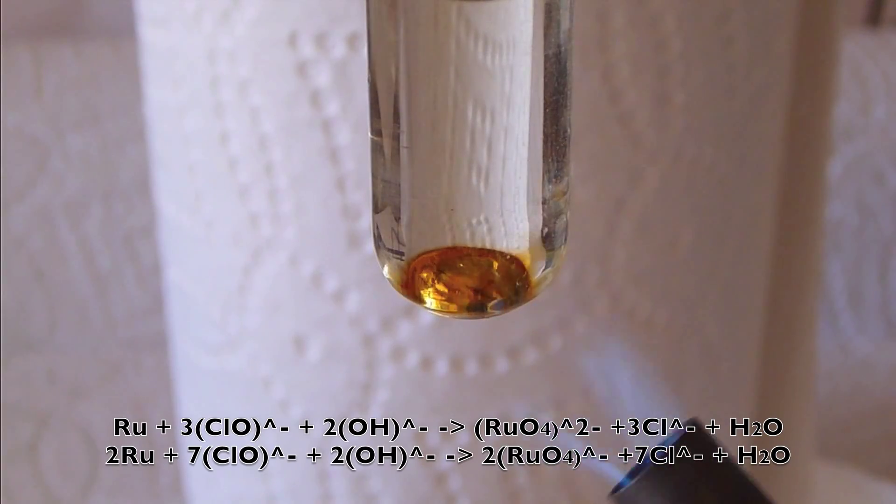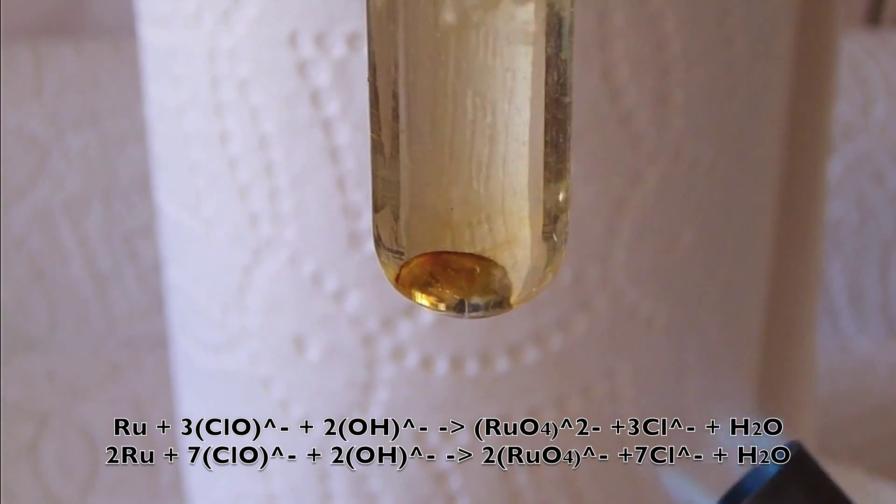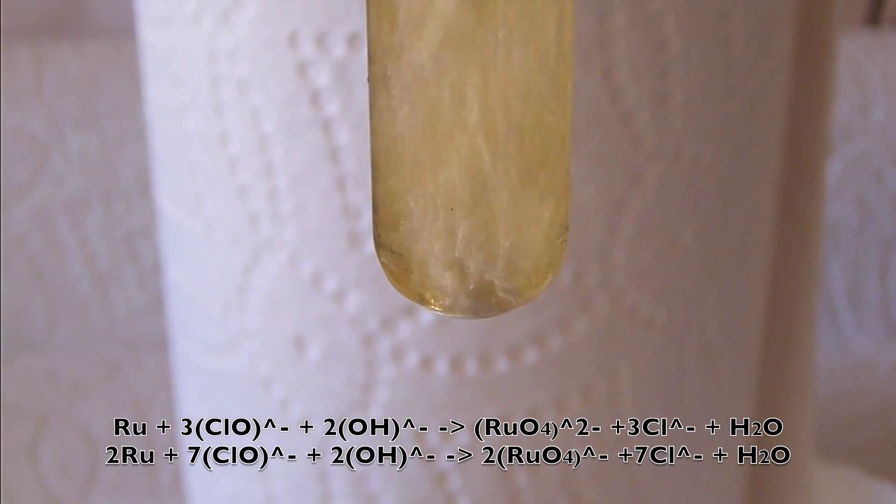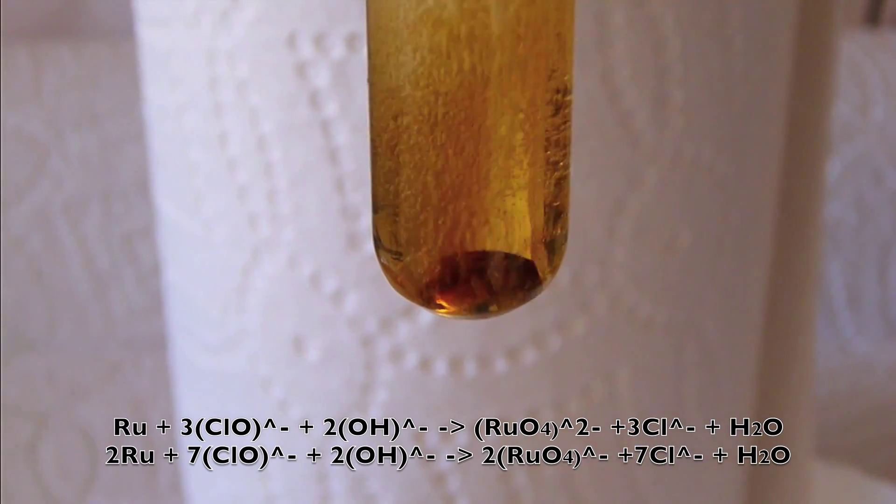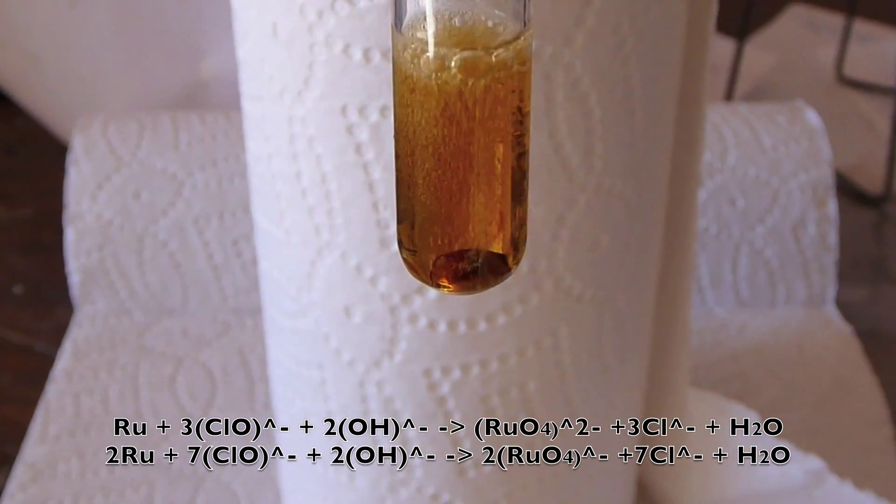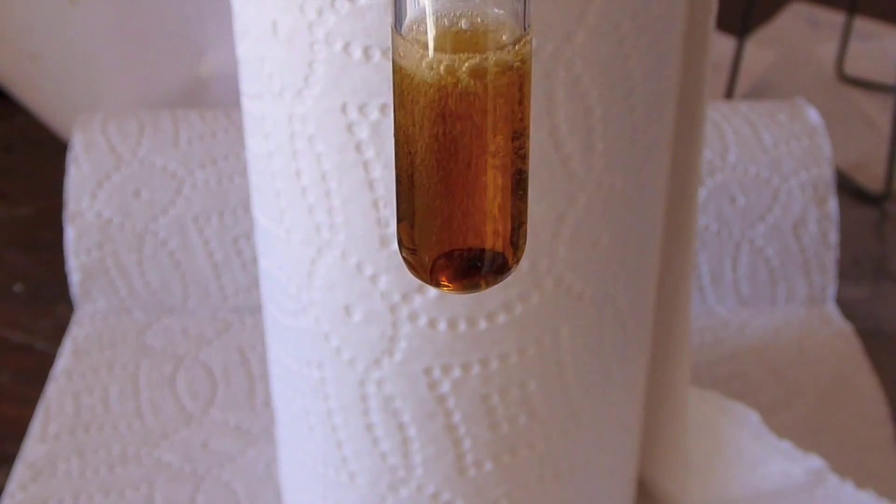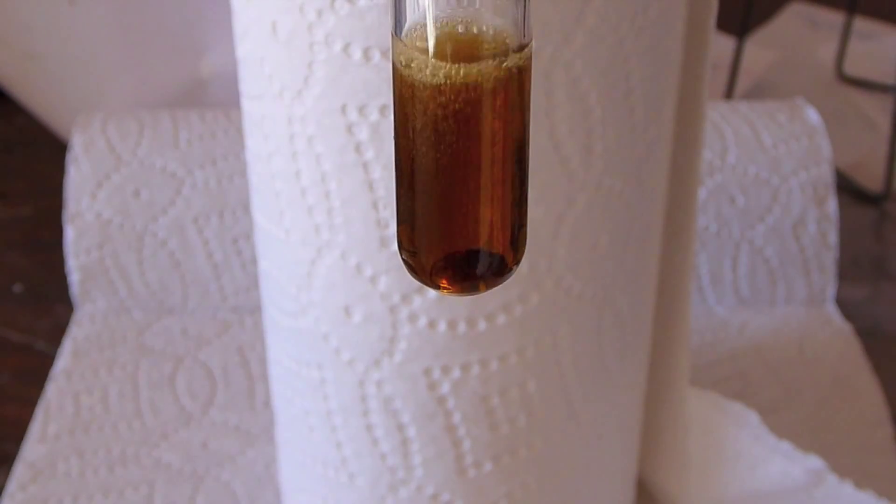As the ruthenium continues to react, you see the solution gets quite a bit darker. It ends up kind of a muddy brown color. This is a mixture of the dirty green perruthenate and the bright orange red ruthenate. To get pure ruthenate, I remove the ruthenium from the solution, and I haven't done that yet, and I let the solution sit out for a few hours.